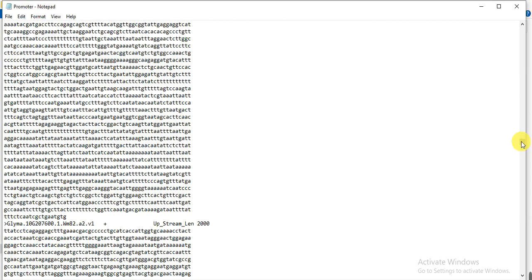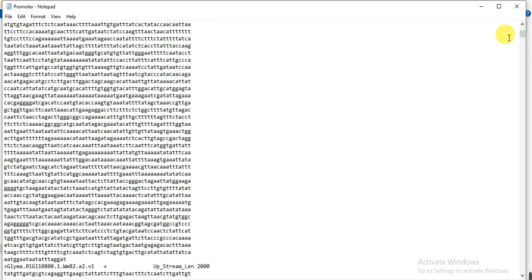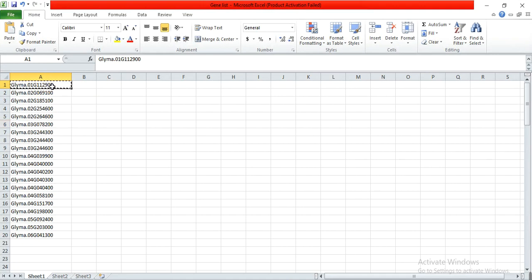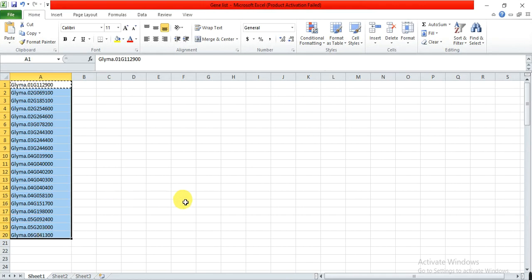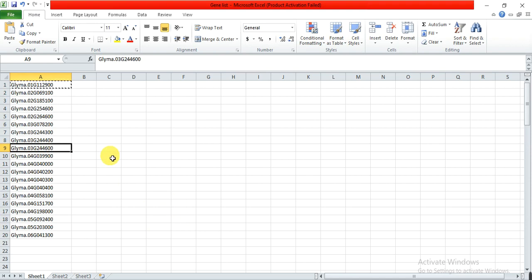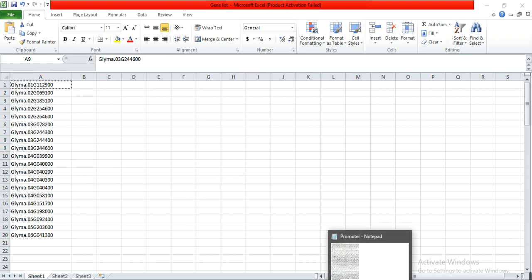This is the whole genome promoter region of Glycine max — possibly thousands of genes, each with its promoter. Now I want to extract the promoter region of my specific study genes — a particular gene family. I have a list of genes and I need the promoter region for those specific genes, so I will use this whole-genome promoter file we just created to extract only my genes' promoter sequences.